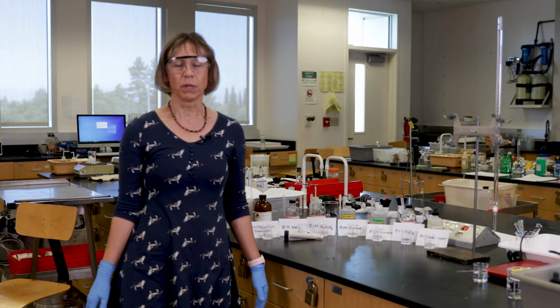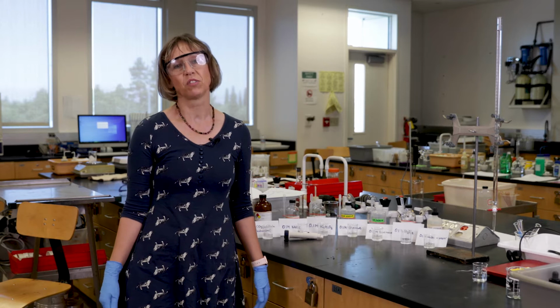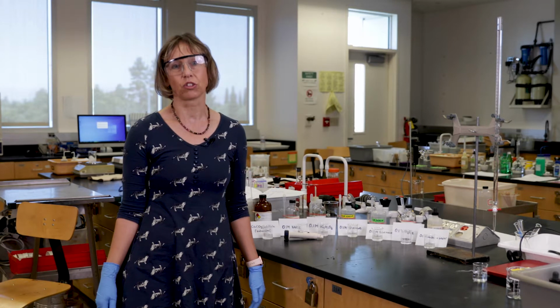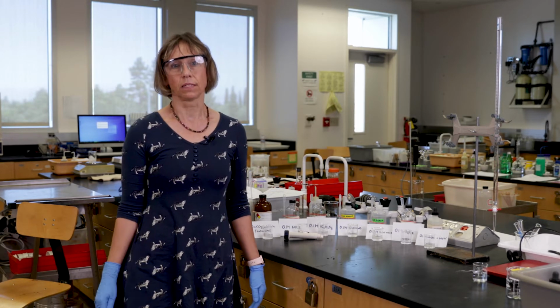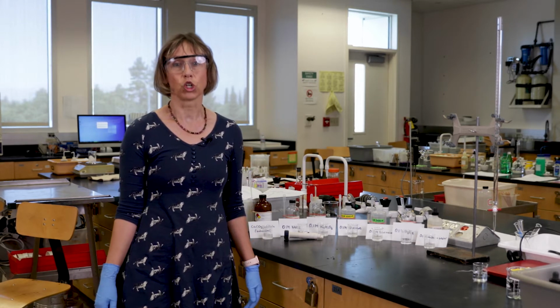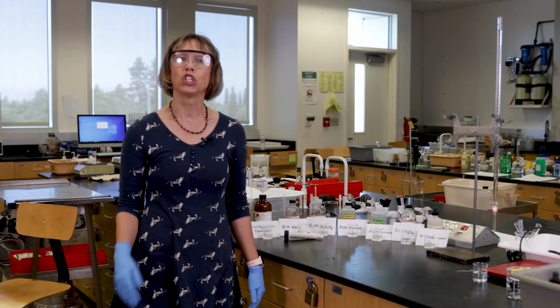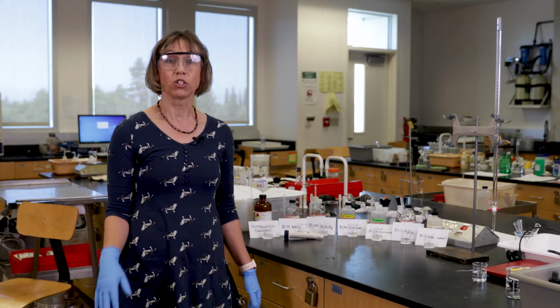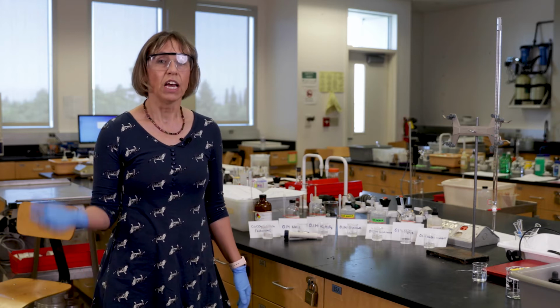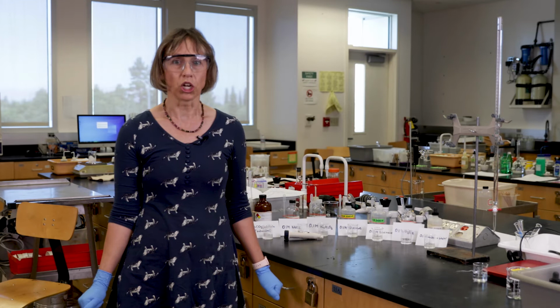In this experiment, we're going to have 3 parts. In the first part, we just determine if something is a strong or a weak electrolyte. In the second part, we're going to connect that with different molarities, different concentrations, and different type of salts. And in the third part, we're going to measure the conductivity in a series of dilutions. Okay, let's start with the first part.